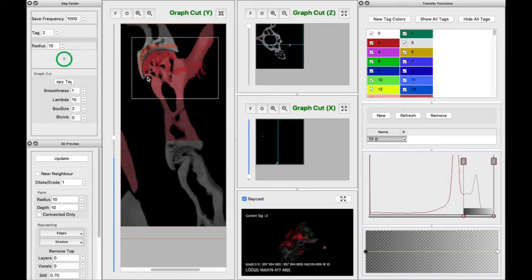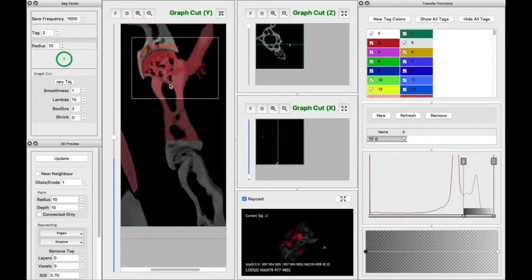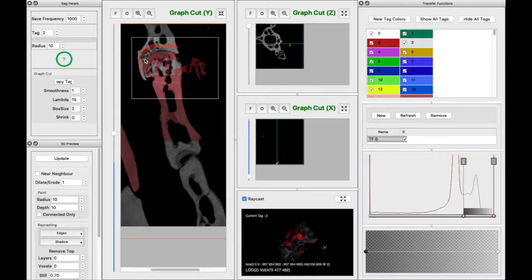There will also come a point at which it'll start getting small again. And at that point, it's going to be hard to decrease the paint that you've laid down every time. You'll have to go in and right click erase it all. And see, look, it's starting. Yeah, this is the point where our paint will start going over the boundaries that we actually want.